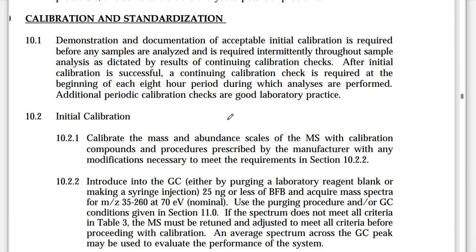Section 10 is calibration and standardization. So again, calibration and standardization is all about this idea: I'm going to make a cal solution, and that cal solution has a known concentration, and that is going to relate to a signal. So it's this concept that a signal is going to get generated. What does that signal actually mean?